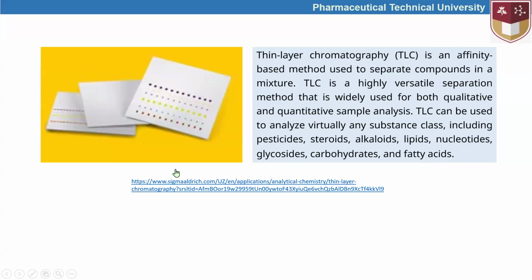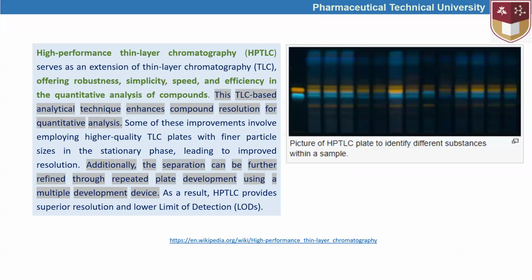These are the points that we have to pay special attention to. This can be found by reading the reference literature. So you can find from NCBI as many publications as possible about TLC and some new approaches of TLC that we are going to talk about here.